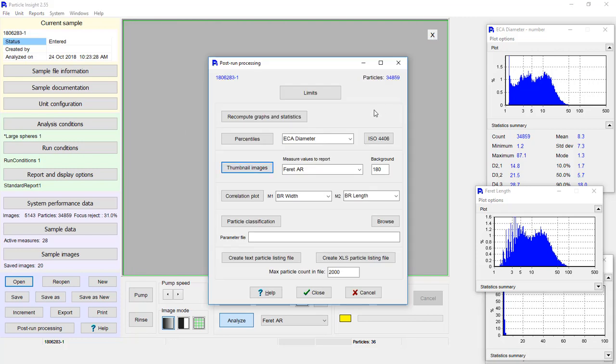But right now we've gone through all the images. We have 30 different shape measures. What do we do with that? This is obviously just a lot of information. So what you do with it is actually what's really of value. It's not how much information you have, it's what you can do with it. When I start looking at some quantification of information, that's where I start getting more value out of the data. So looking at, for example, here's one.